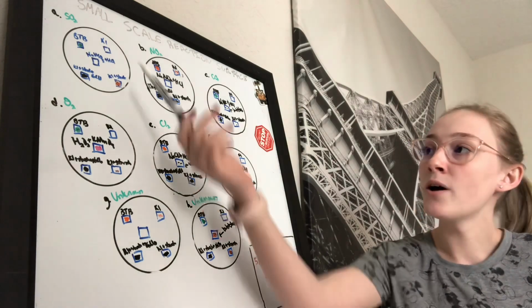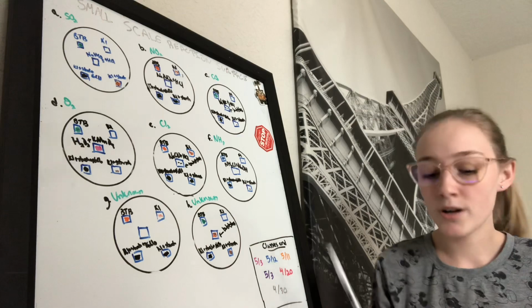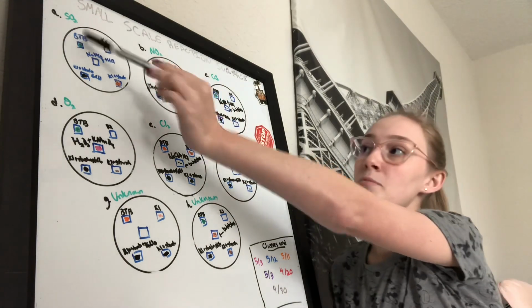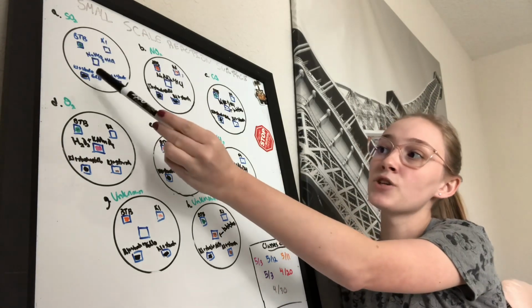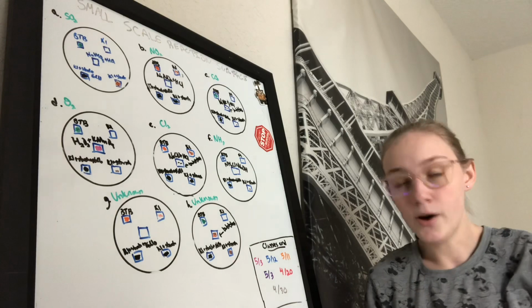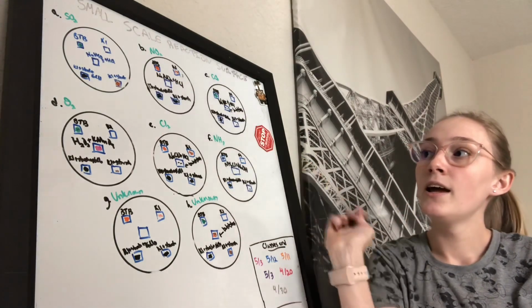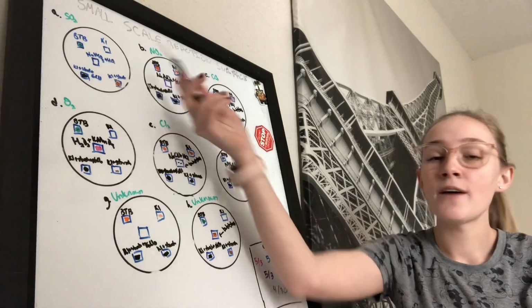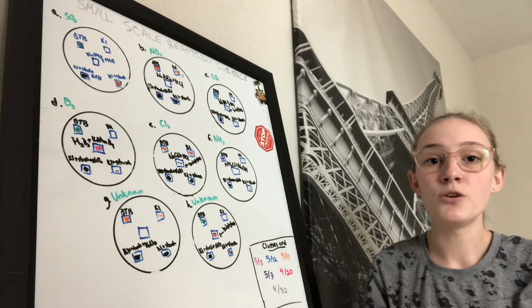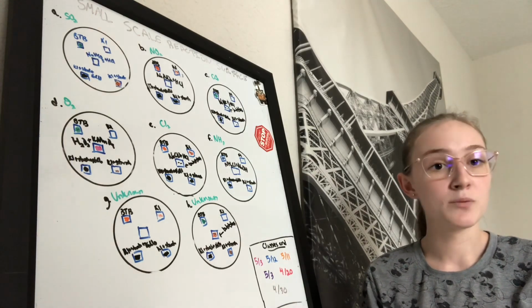So we're going to start out, and I'll explain how to do A and then I'll go through the rest of them. Before the incubation, you put your BTB, KI plus starch, and KI plus starch plus NaClO. Then you add them all together and mix it in the middle, and after a 5-minute incubation, those will serve as color indicators, so then you know what the identity of the gas is that was produced.